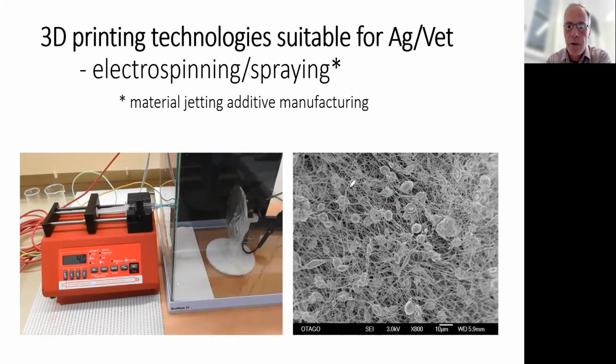These fibers can contain drug or other bioactives. Certainly these particles here would be quite significant reservoirs of any bioactive. And as I mentioned, you can build up layers of different material. You could start with a water-soluble layer, spin a fiber particle layer, or just a fiber layer of insoluble material, and build up layers for whatever application you might have.